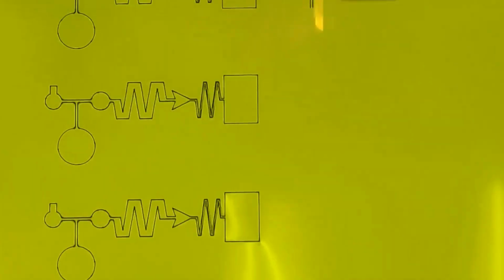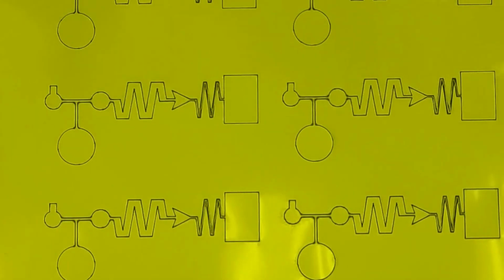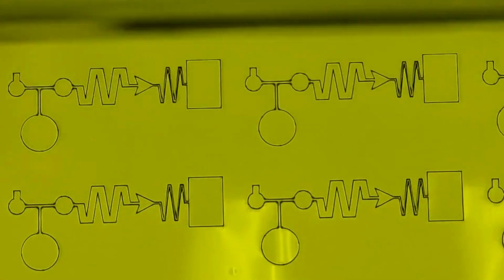The challenge for us has been to fabricate and optimize the design of the microfluidic chip using COMSOL Multiphysics and AutoCAD, so that the chip is able to perform the way we want it to, while still retaining the function of being able to be assembled autonomously using the Mechademic robot.